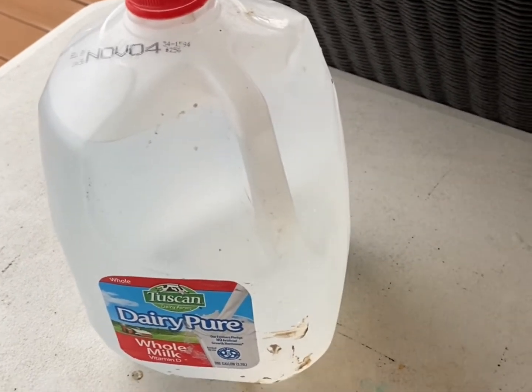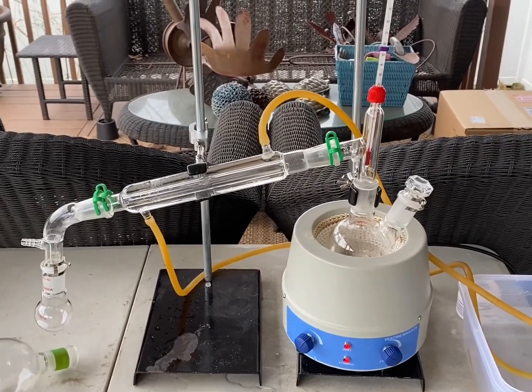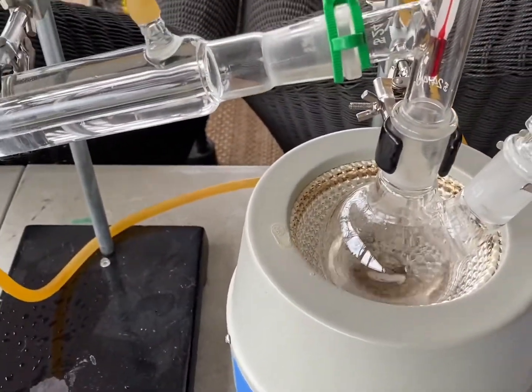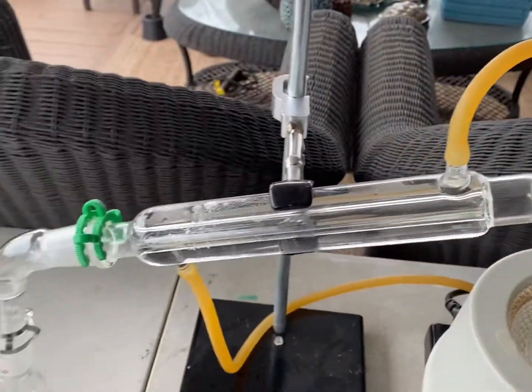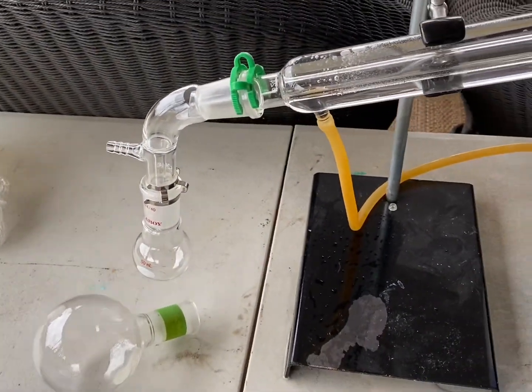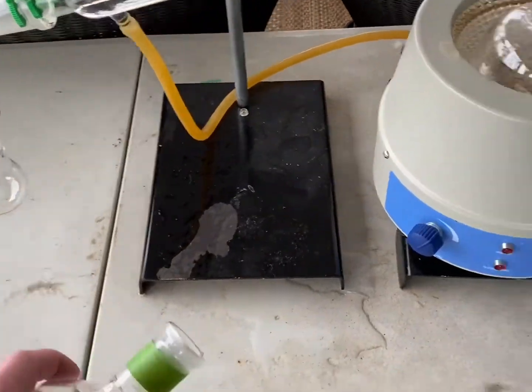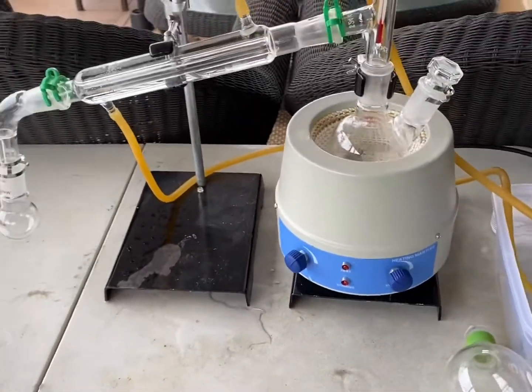Well, there you go. Okay, so now we're going to be doing a simple distillation of the chloroform to purify it. So we will be collecting everything that comes over above 60 degrees Celsius. Everything below that we will discard. So I have a small flask to collect everything that comes over below 60, and everything that comes over 60 I'm going to collect on this because I measured it. I weighed it, so I can determine our percent yield for this reaction. Okay.